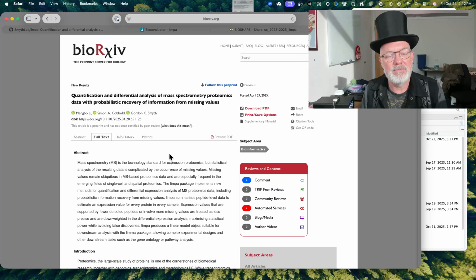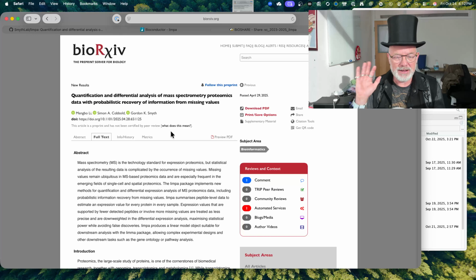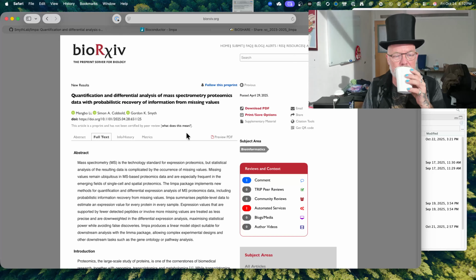I'm a little fuzzy on how it works, but I think I kind of understand it. So we're going to go through it in the paper, and I have an example project we're going to go through. It should be pretty easy for you guys to do it on your own data.